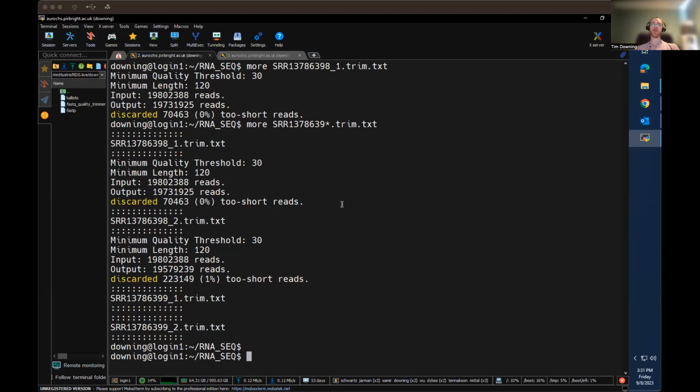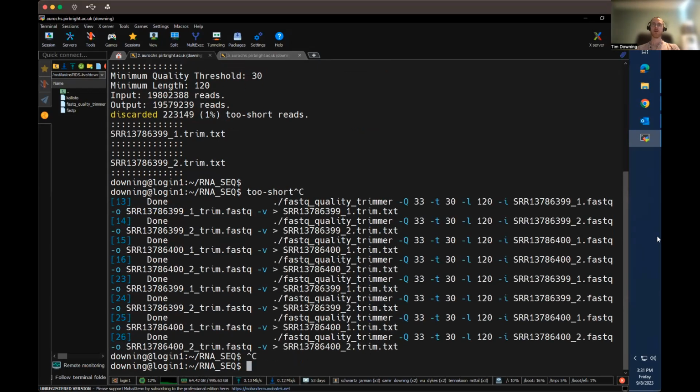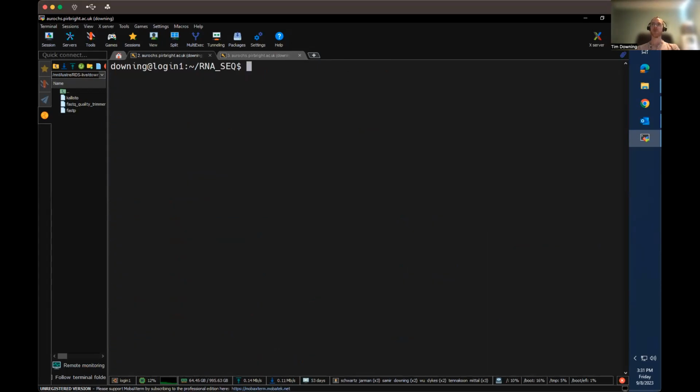Following that, we wish to run the fastp over-representation analysis. And again, the structure for that is the same. So we take our sample that's of interest. And here we're going to put in our input file. So we're going to set the same file stem, 398. That's the HTML output file, I should say. And our input file is next 398_1_trim. So we have to do this twice for each pair of files corresponding to one sample.